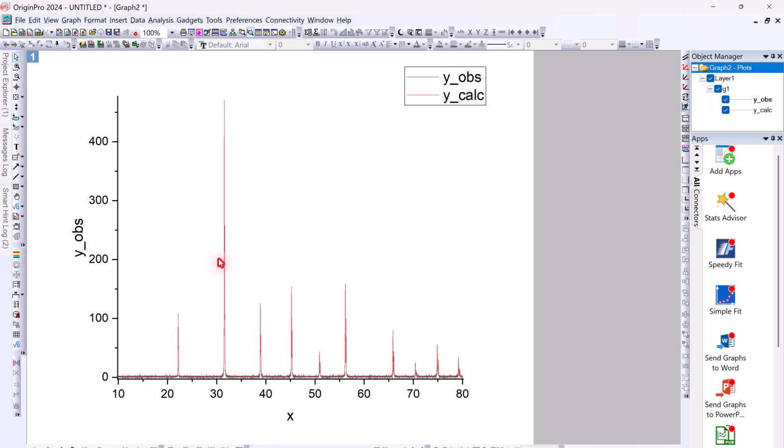Now this calculated data, the smooth one, or even the experimental data can be placed as the PDF card showing that this is the simulated XRD pattern. Instead of only lines, we can use the actual data in place or experimental data on top of it to show the peak positions, etc. The same process can also be done in VESTA. With VESTA, we can generate the simulated pattern, and we will show that in another video.